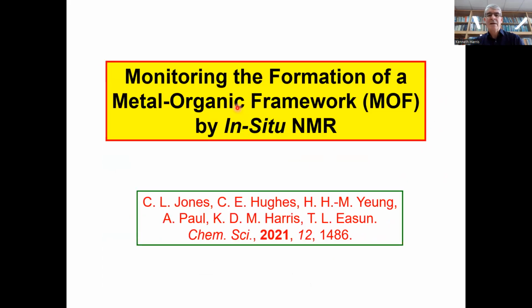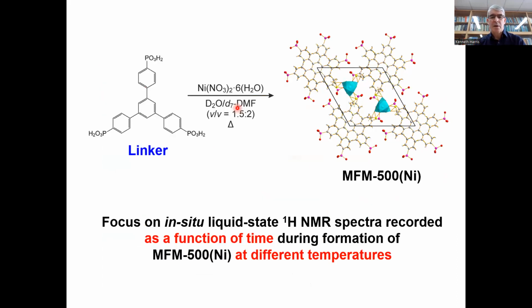I also want to discuss some recent work on monitoring the formation of a metal organic framework by in-situ NMR. Again, this utilized the classic NMR experiment to study the formation of this MFM-500 MOF containing nickel and this linker shown here. We carried out a classic NMR experiment, but what I want to focus on is our in-situ liquid state proton NMR spectra as a means of getting very detailed information on the kinetics of this MOF formation process.